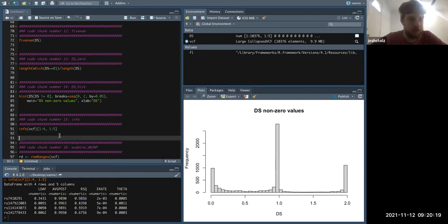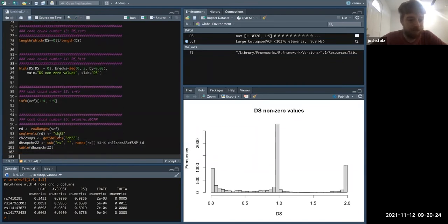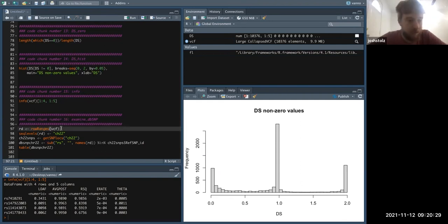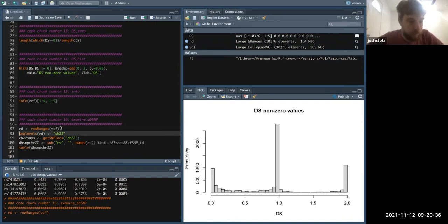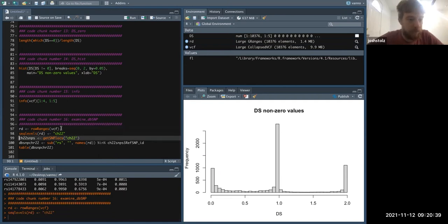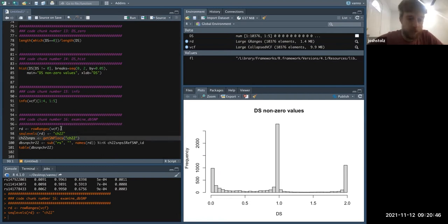Most papers I've read have a cutoff of 98, so even this would be on the cusp of not being used. But we can look and see if there's some kind of a bias on a smaller scale. So we're going to download the dbSNP database.